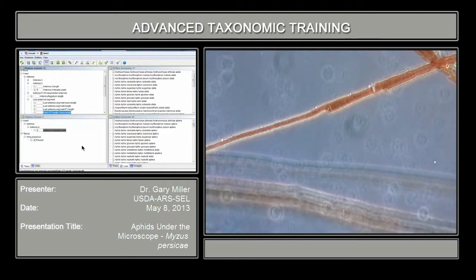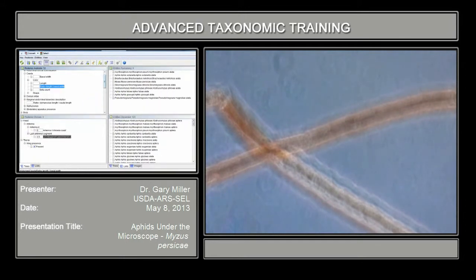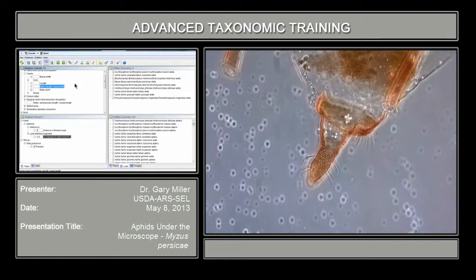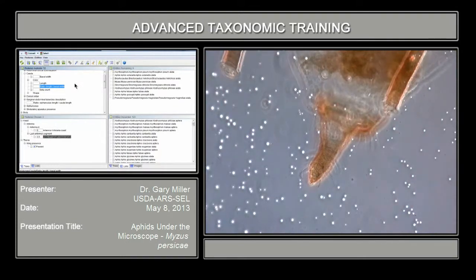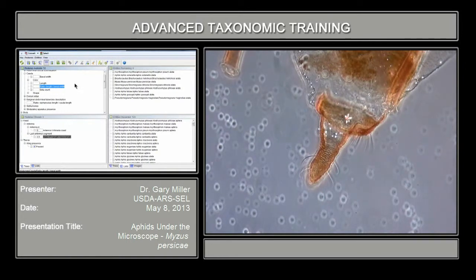So I'm going to measure this. I get 3.5. Now we're going to look at the ratio of the length to the basal width, and this is in the cauda. So we're going to be measuring. The base is going to be from here to here, and the length is going to be from here to the tip.